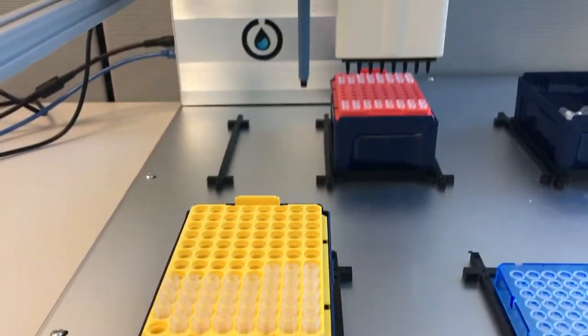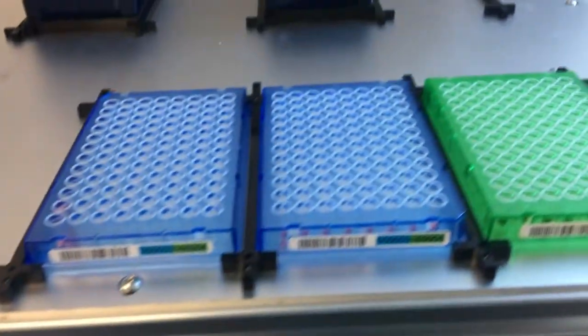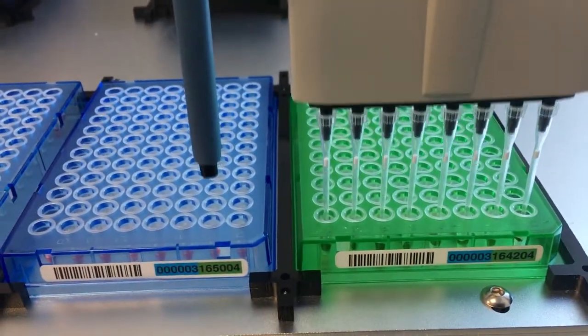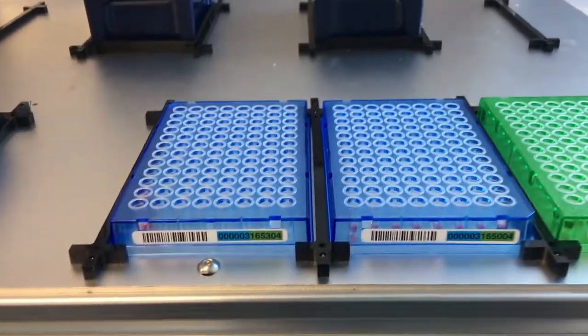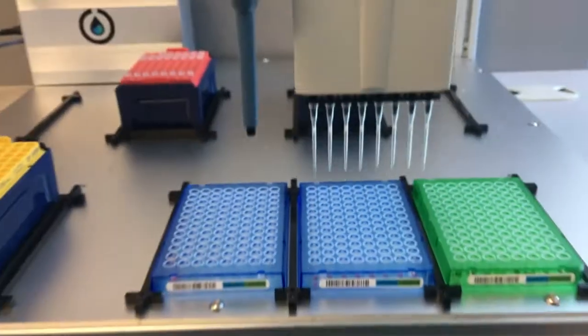Now it's just going to pick up these P10s. These P10s allow us to pipette smaller volumes. There's going to be a 2 microliter aspiration from this plate that has samples that have been boiled. And it looks like we've got a good pipette — everything's even there. And that's all she wrote.